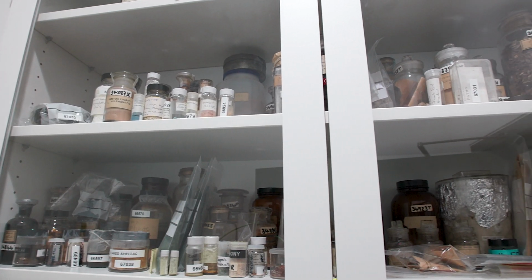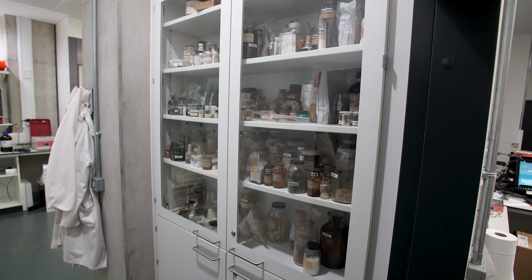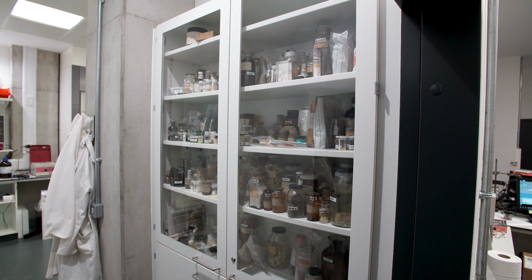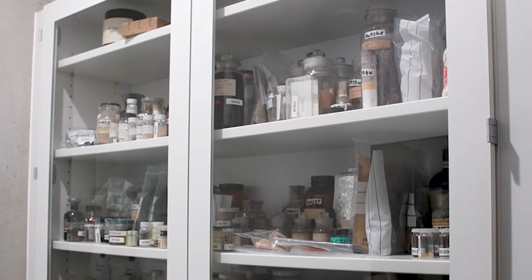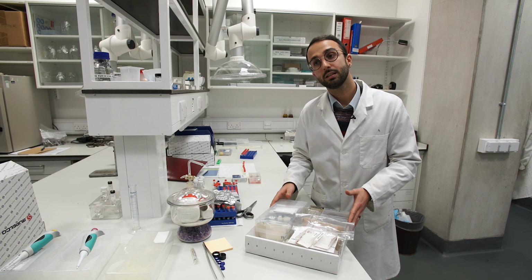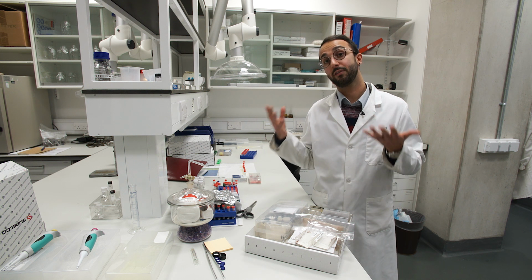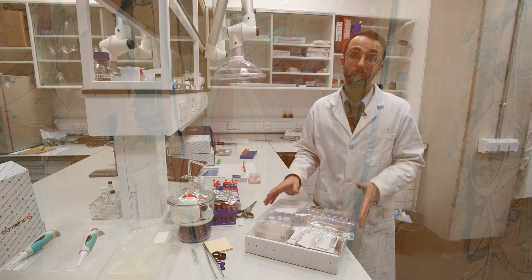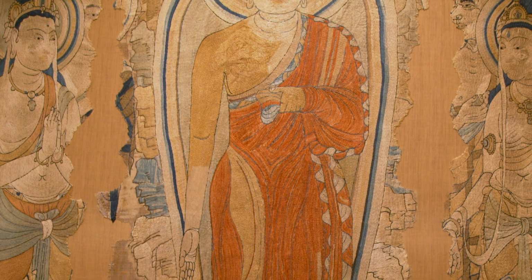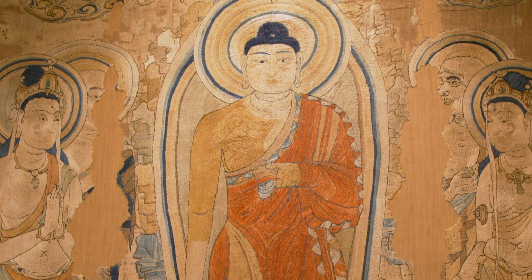We are talking about China and 8th century, so they might have used some very local and particular plant which I might miss in my collection, and I'm going to be able to reconstruct the original colors of the textile, which actually shows a lot of fading. So everything that now we see orangey, yellowish, might have been red, for example, and I can say that from this kind of analysis.